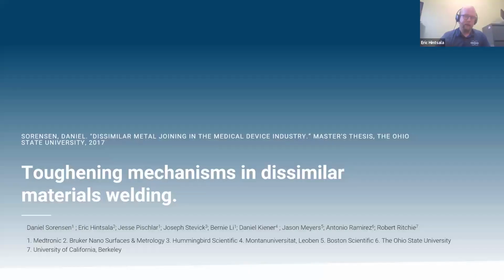So with that, I want to start getting into the case studies. And this one, I felt like I should really show because it involves the Ohio State University. This is mostly Daniel Sorensen's work, who did this as part of his master's thesis at the Ohio State University with Antonio Ramirez. When he did this work, he was at Medtronic, and I was heavily involved along with a few other collaborators in industry and academia who are listed on the slide. So this is all about looking at welding zones.